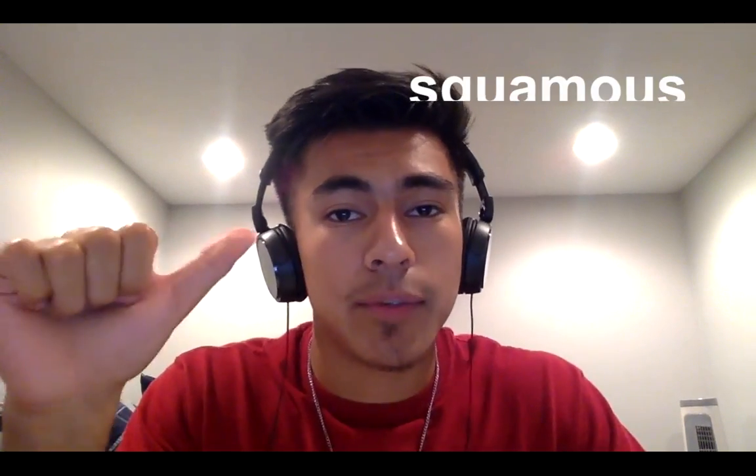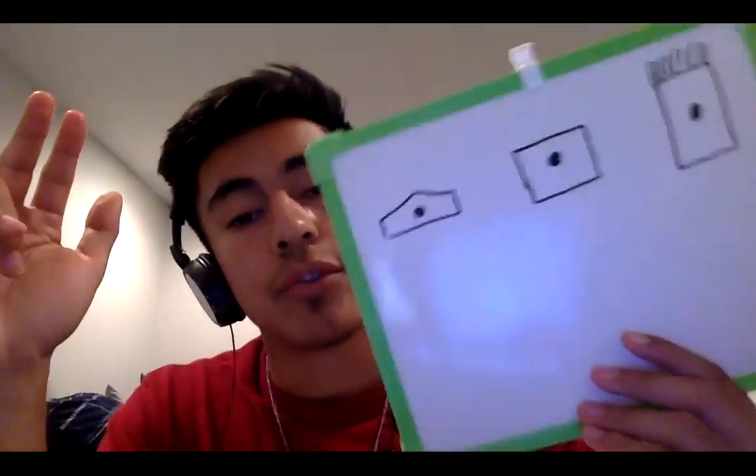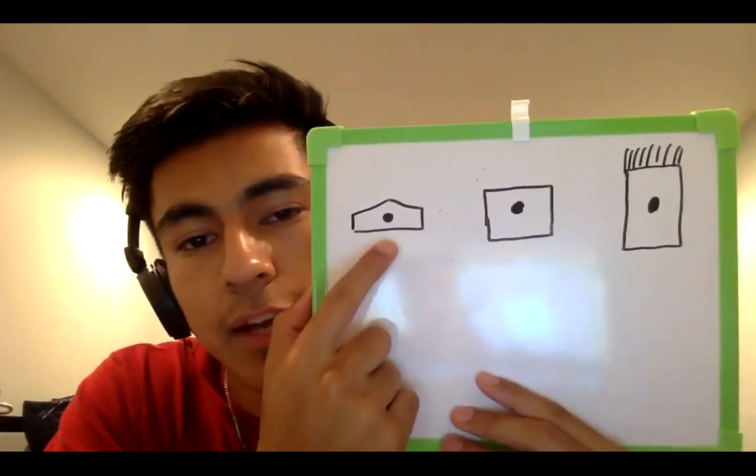We're going to start off with the three main types of cells you want to look at when you're looking at epithelium tissues. These will help give you really big indicators and help you differentiate all these different tissues. So starting off, we have squamous, cuboidal, and columnar. I have these three drawn right here. So right here we have squamous.